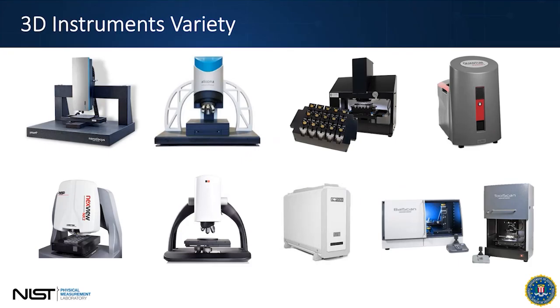And that's probably why we're starting this series of workshops, to give you an idea of what kind of technology is being employed to actually get you that 3D image on every single instrument currently in the market of firearms and tool mark analysis, how they work, and what do you have to worry about? What do you have to think about?